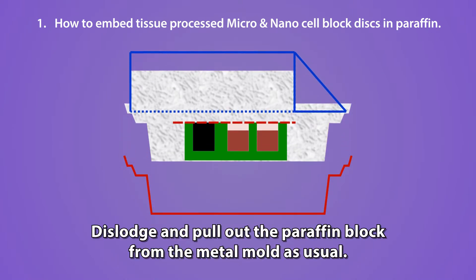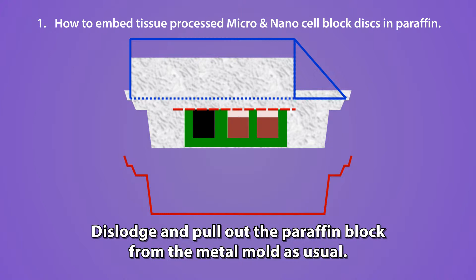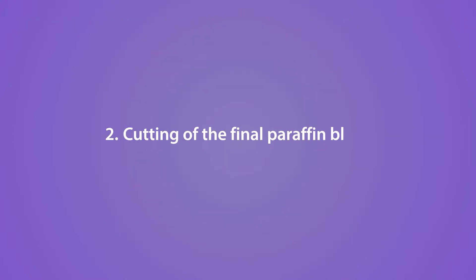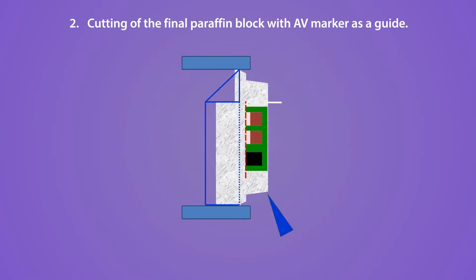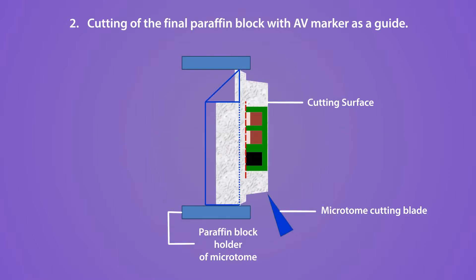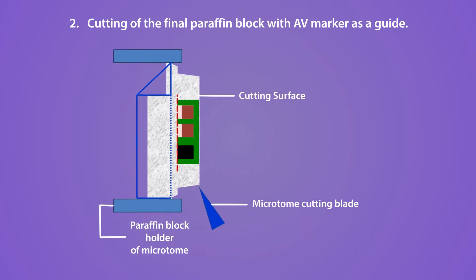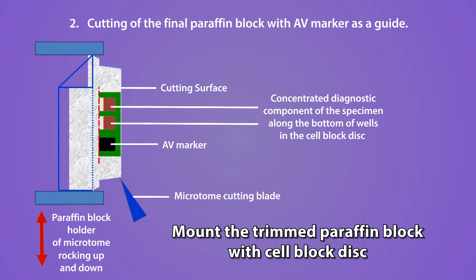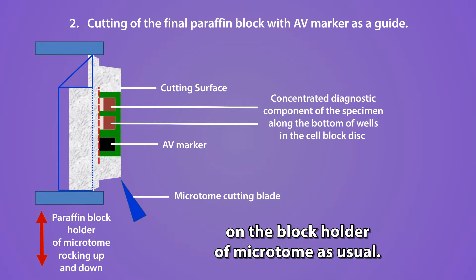Dislodge and pull out the paraffin block from the metal mold as usual. Use the AV marker as a guide for cutting the final paraffin block, then mount the trimmed paraffin block with the Cell Block Disc on the block holder of the microtome as usual.